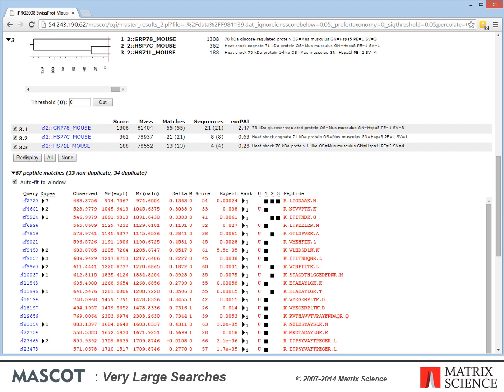There is nothing special about the protein picked for the anchor position. You may have a preference for one according to taxonomy or description, but all proteins in the same-set group are indistinguishable on the basis of the peptide match evidence.